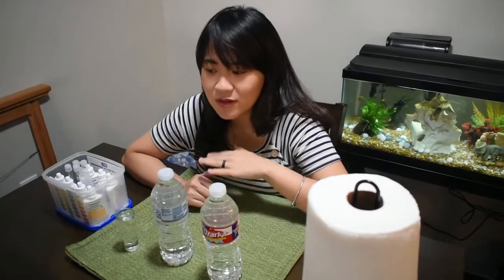Just so you know, the water I want to test is to see if there is ammonia in there. If you guys don't know what that is, you can Google ammonia, but I will explain a little bit. If we drink a little bit of ammonia, that's fine, but it's poisonous even for fish. So if there is really high ammonia in my tank, my fish will die so fast. That's really poisonous for fish or even for humans. If we drink really high ammonia, it's really dangerous for us.